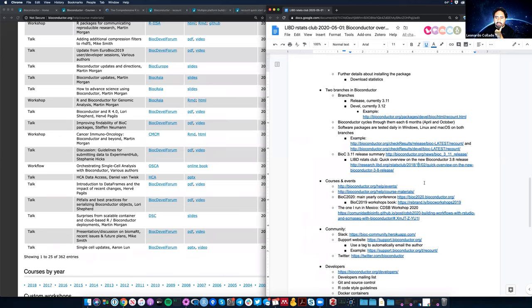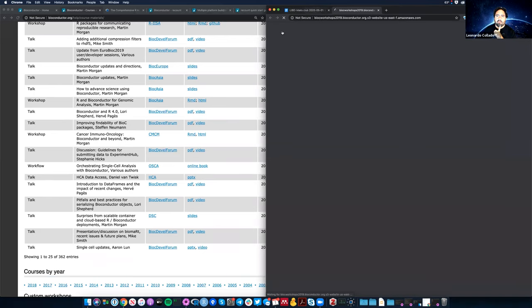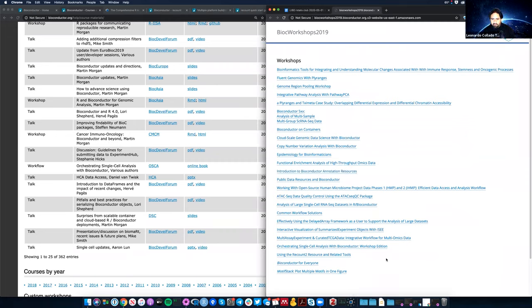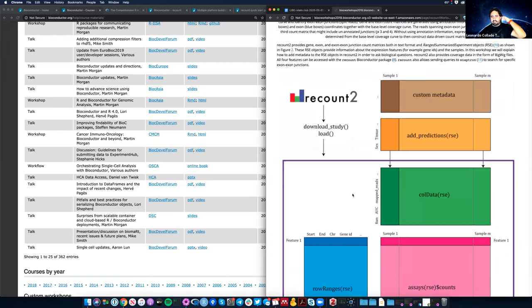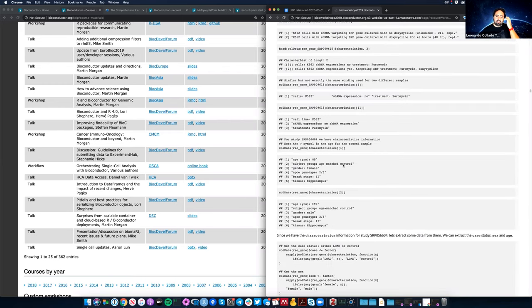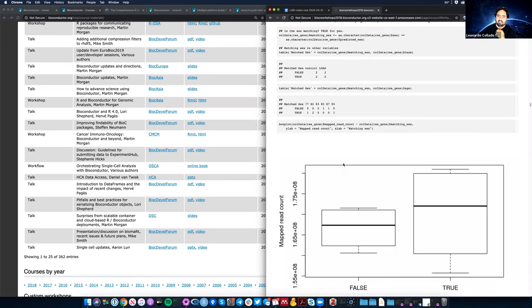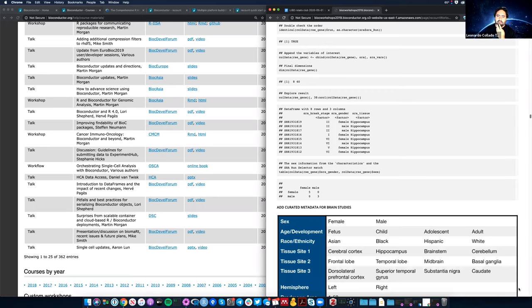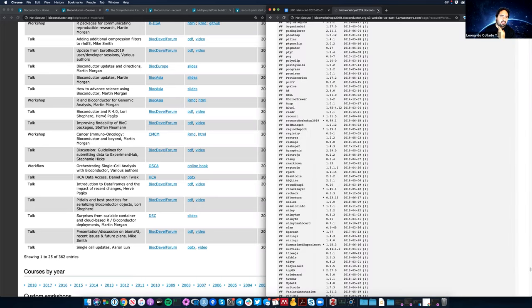One link I like is the Bioconductor 2019 workshops — everyone who taught a workshop at last year's conference made a little chapter for this book. If you click on any of them — like the one I made on using recount — each chapter can have images and code that you can copy-paste and it should work. There's also a Bioconductor developers forum that meets once a month on Thursdays, with YouTube videos from those meetings.